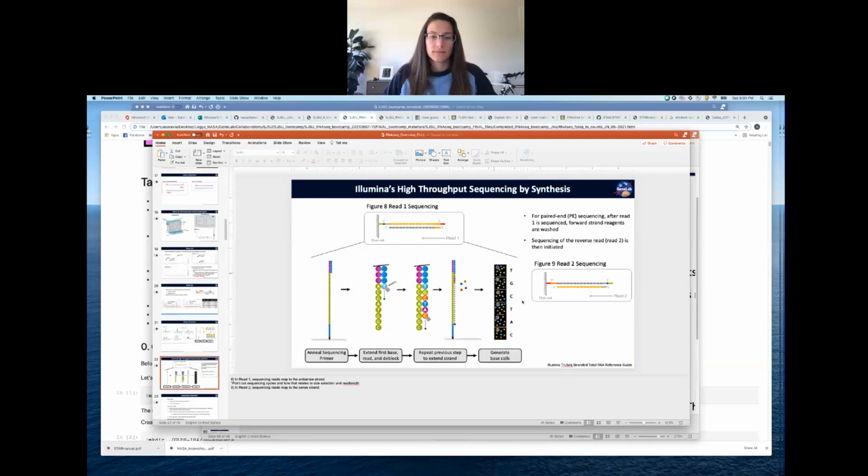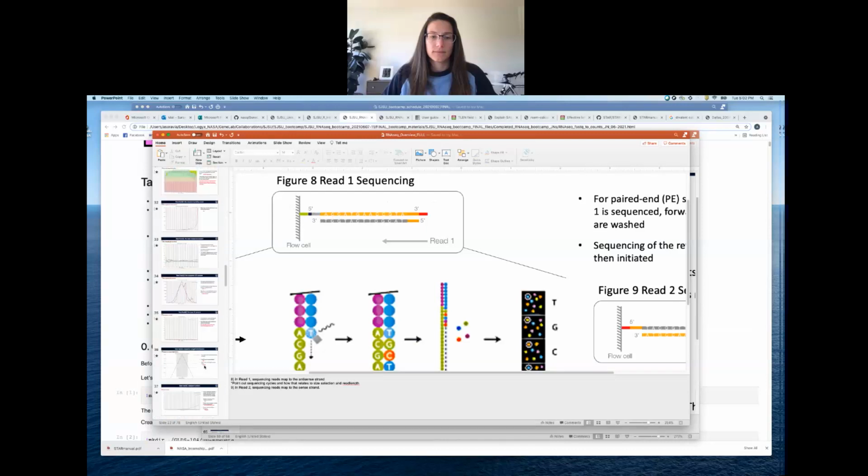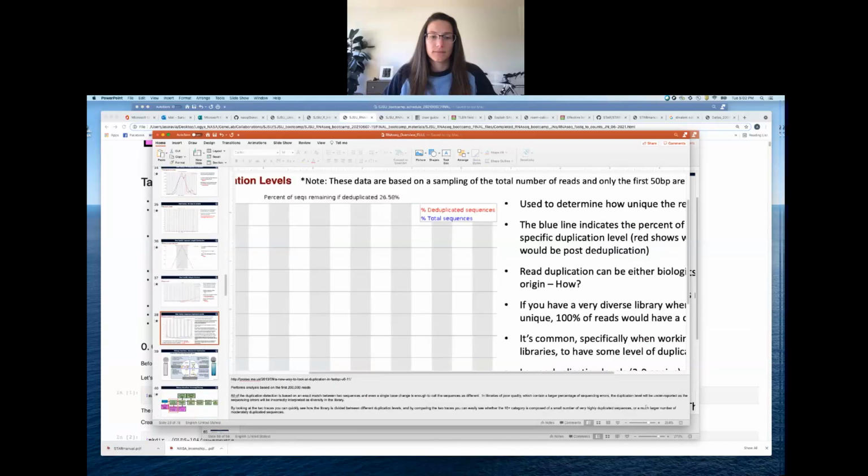Okay. So as you're going on here. Zoom this in. If we're taking a look at the sequencing, we're going to start here at this primer region, and we're going to start sequencing right into our region of interest. And as you go on, this is going to be the 5' region of the sequence that we got. As you continue on, that's where you'll start sequencing into your adapter. So that's why you almost always see your adapters at the 3' end of your sequences, because of the nature of where the sequencing starts. It starts at the start of your insert, and then if it goes forward, that's where you'll see the adapters in your data.